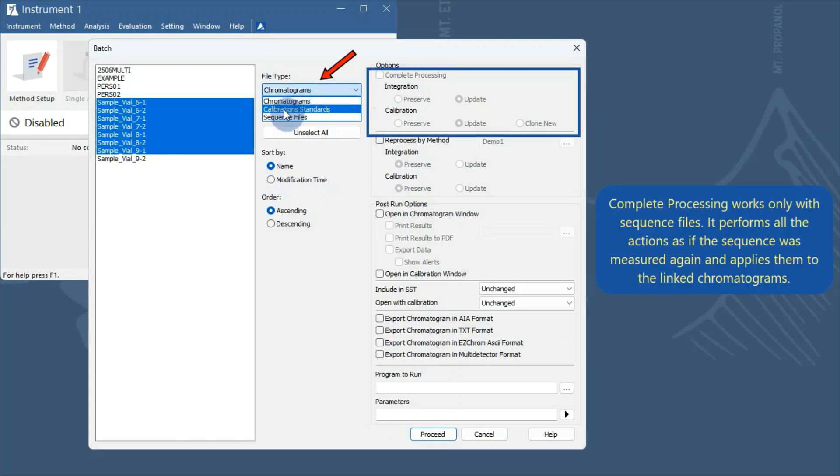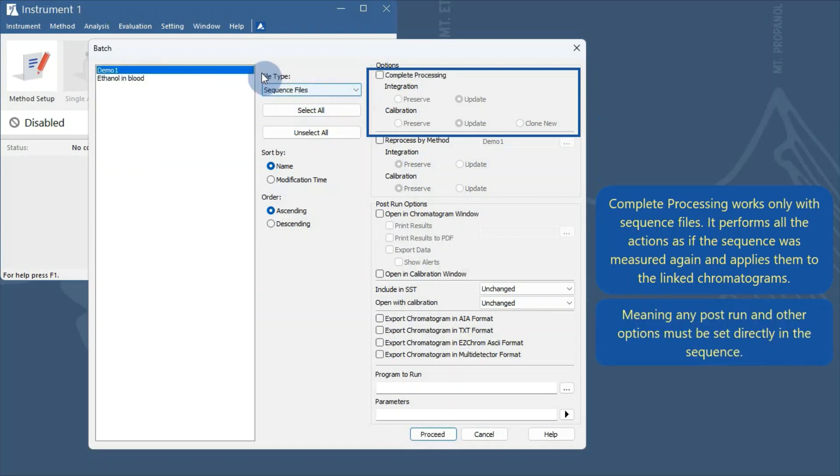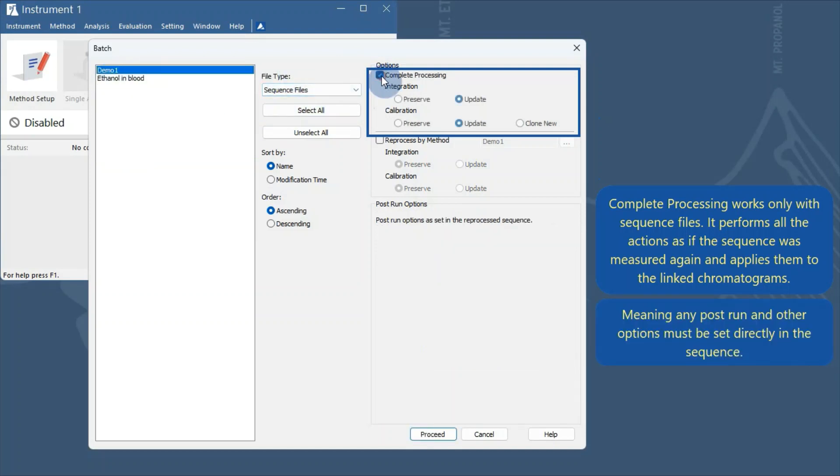Complete processing works only with sequence files. It performs all the actions as if the sequence was measured again and applies them to the linked chromatograms. This means any post-run and other options must be set directly in the sequence.